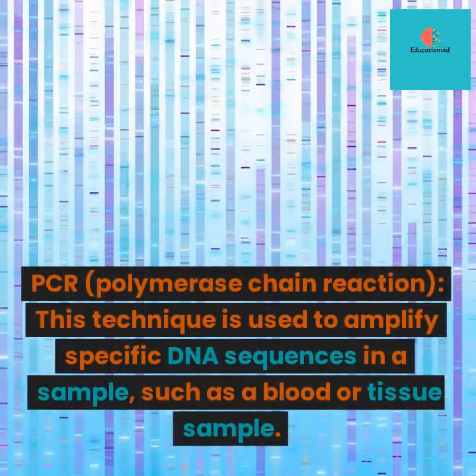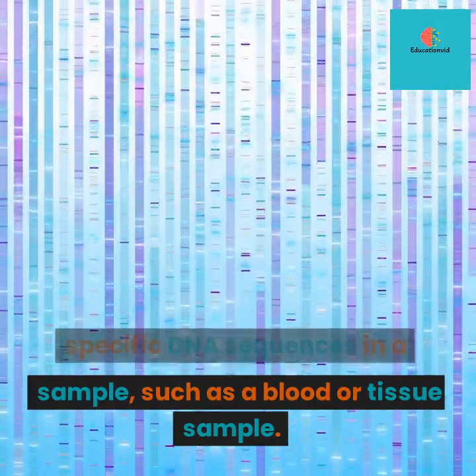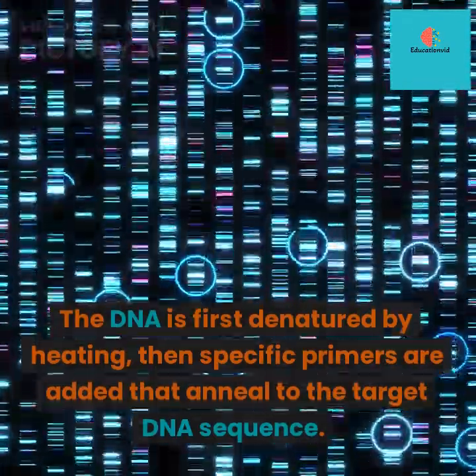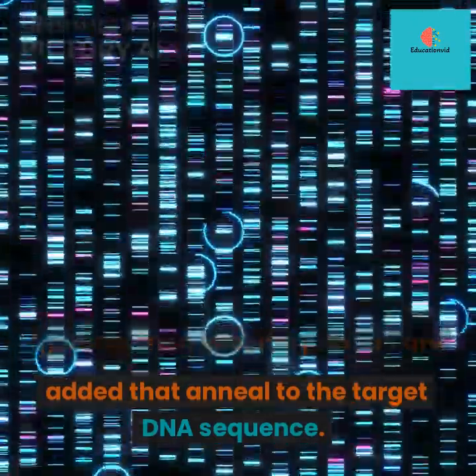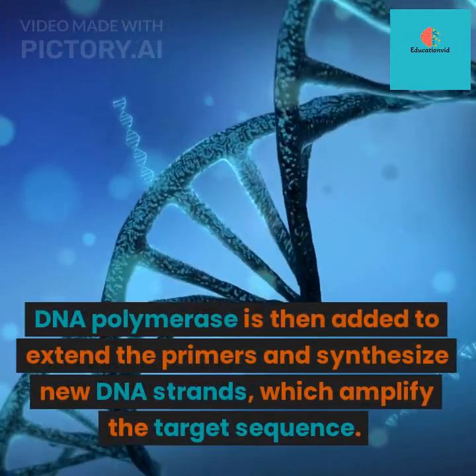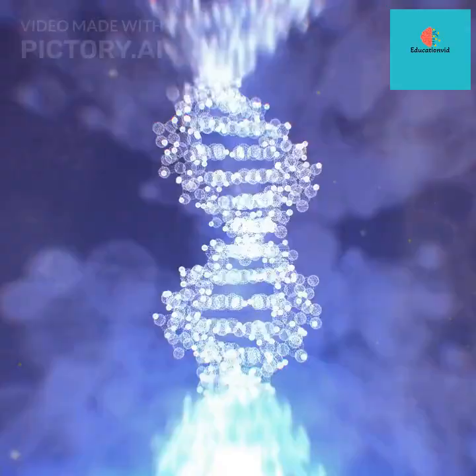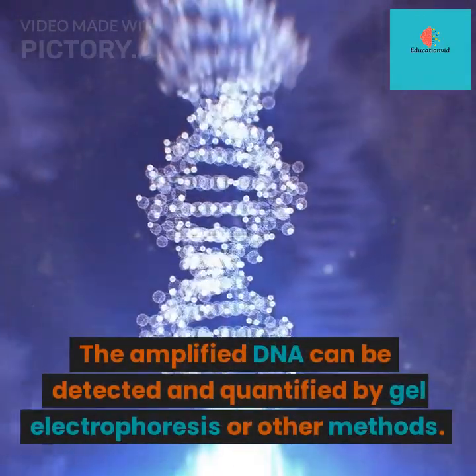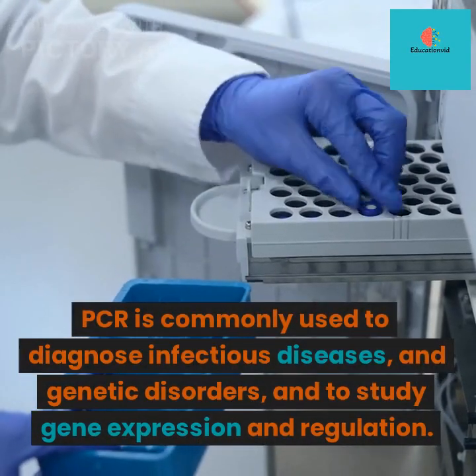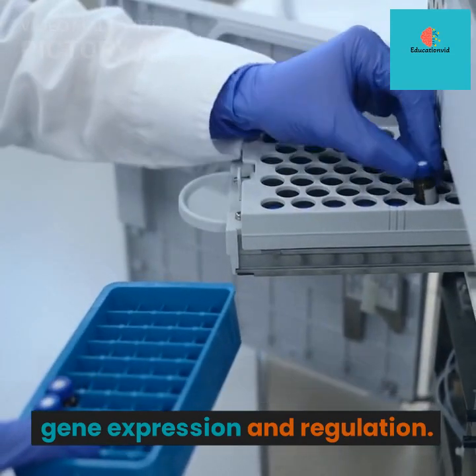PCR, polymerase chain reaction. This technique is used to amplify specific DNA sequences in a sample, such as a blood or tissue sample. The DNA is first denatured by heating, then specific primers are added that anneal to the target DNA sequence. DNA polymerase is then added to extend the primers and synthesize new DNA strands, which amplify the target sequence. The amplified DNA can be detected and quantified by gel electrophoresis or other methods. PCR is commonly used to diagnose infectious diseases and genetic disorders, and to study gene expression and regulation.